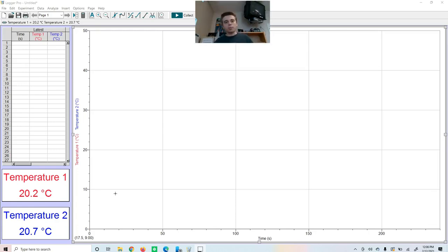So we're going to look at a couple different chemicals. The first one we're going to look at is comparing hexane and heptane. Then the next one we're going to do is methanol and ethanol. Then we'll do acetone and isopropanol. And then finally, we'll look at water by itself at the end to determine what the temperature change is.